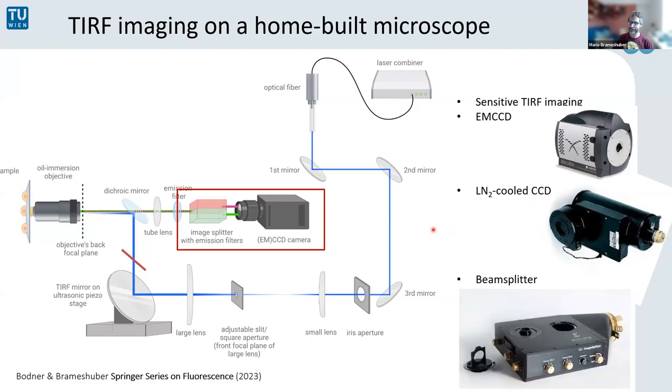And the last thing, because we also do multicolor imaging, we build our own image splitters. I will also tell you later why it's important to have a good image splitter available. And fortunately, as I mentioned before, we get good students, and one of our image splitters was even put into a product by a student. He built his own image splitter, and we're very happy with that.